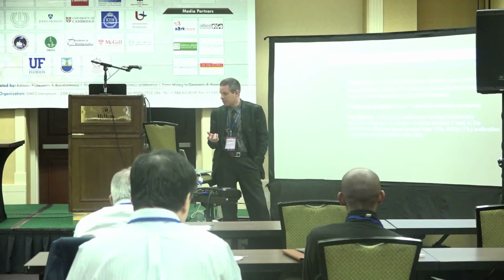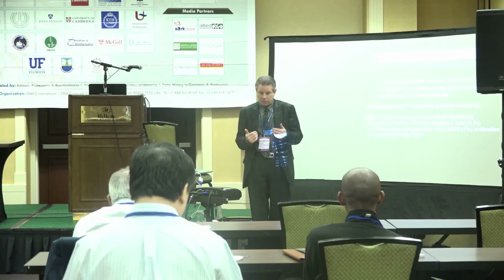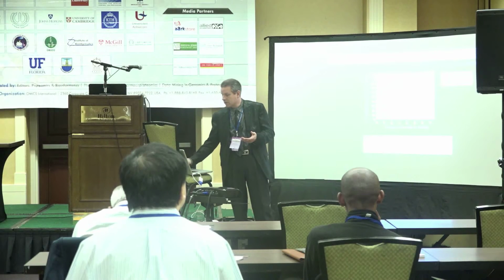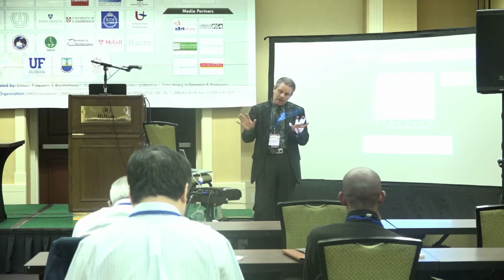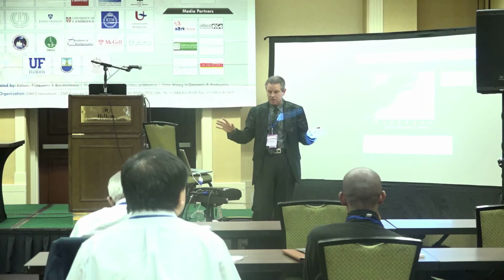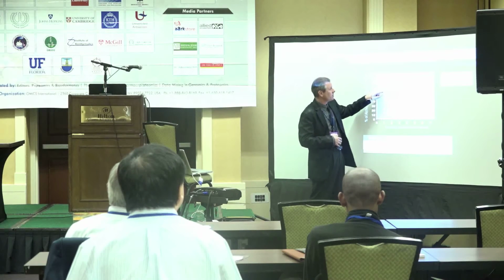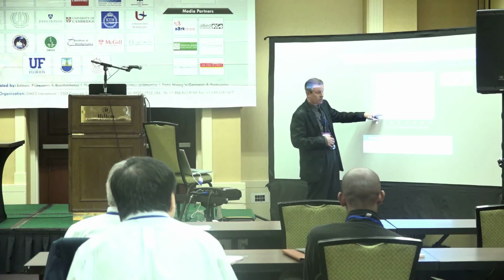So in Alzheimer's patients, we took the serum from Alzheimer's patients and pulled out the peripheral blood lymphocytes, and we ran them down an early microarray, one that had only about 622 antibodies. And from this clinical trial, where we had mild cognitively impaired patients and patients that had Alzheimer's followed over a 2-year period, we could completely separate the Alzheimer's patients from the mild cognitively impaired patients, shown here, male and female, in the dark circles and triangles for Alzheimer's from the controls.